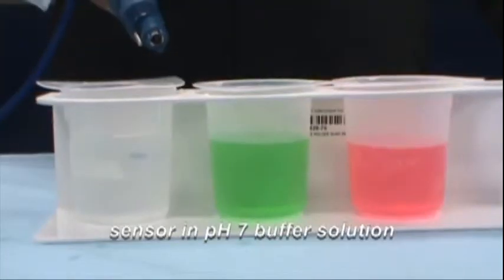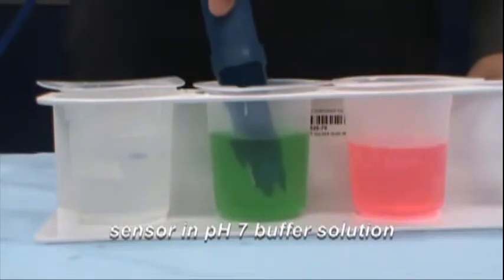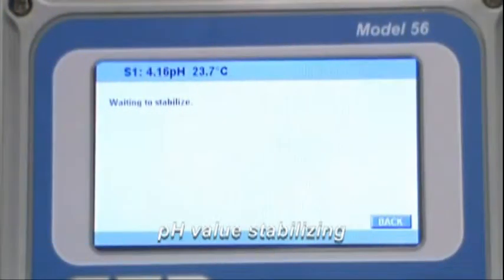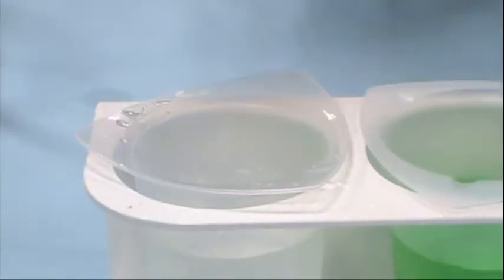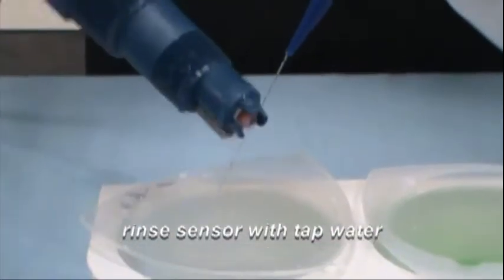Rinse the sensor in the second buffer solution. In this example, pH 7 buffer solution is being used. Wait for the value on the pH instrument to stabilize. Once the buffer value has been acknowledged by the instrument, remove the sensor from the pH 7 buffer solution and rinse the sensor in the rinse beaker.